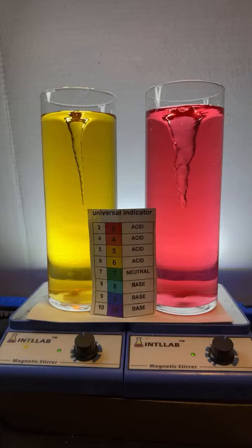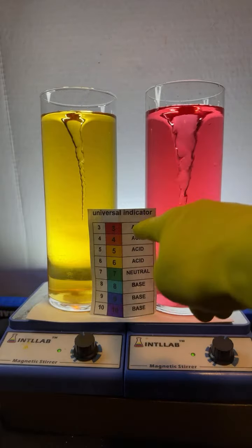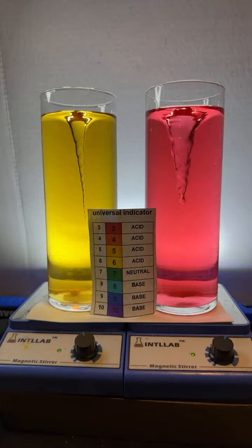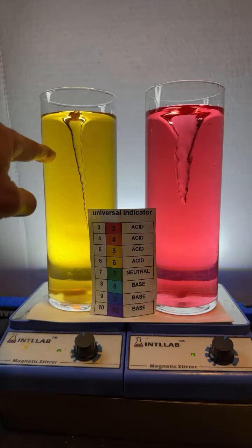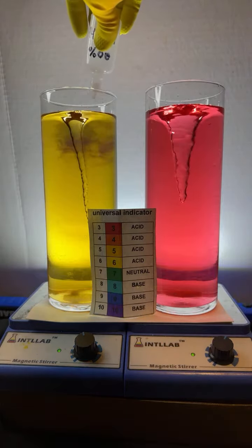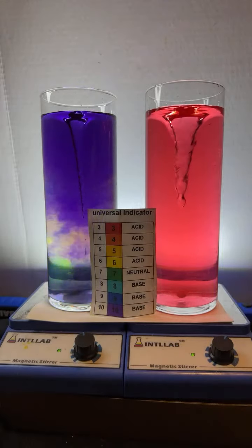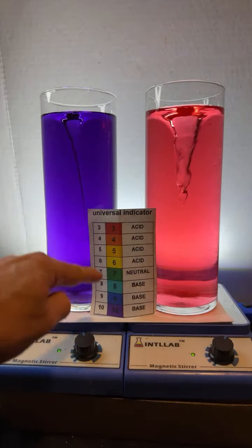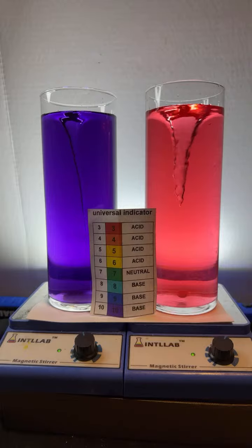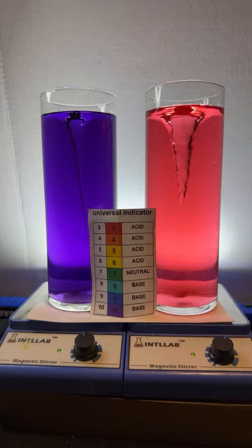Now over here on the right, this is red, so my pH over there is 3, which is also acid, but it's more acidic. So now what I'm going to do to the flask on the left is add some base, some sodium hydroxide base. And when I do that, we get violet. So we made a pH 10. It's very high pH. So the question Ohio Man has been asking and other people have been asking is, what happens if I mix these two together? Well, let's find out. Here we go.